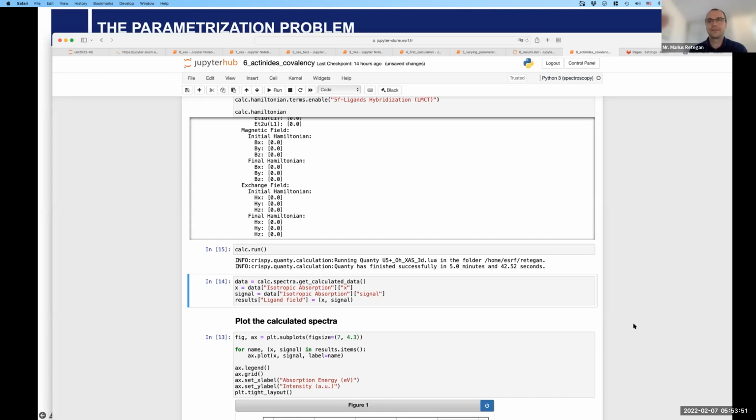For analysis afterwards, I see it not so useful, but I know what Dimitri thinks. Well, Andreas, I think it's inevitable. I'm also not an expert in Python, and it also gives me troubles. But if you measure a lot of spectra at once, like quick EXAFS or energy dispersive, where you have thousands, I do not see any other way than to employ Python.